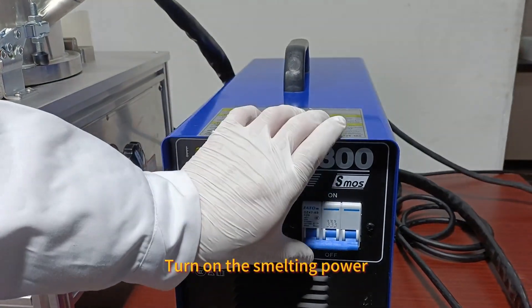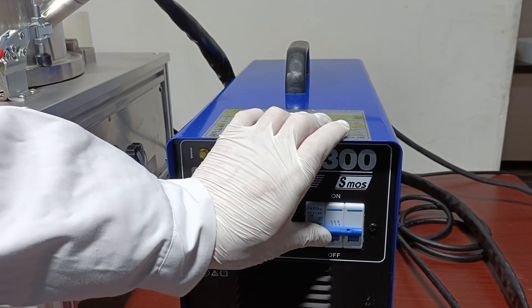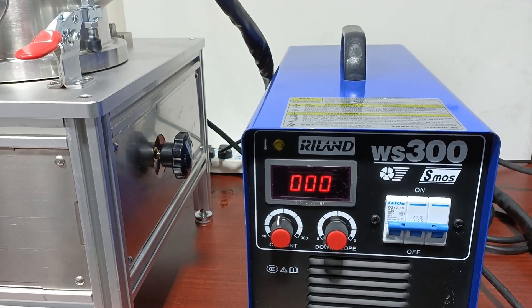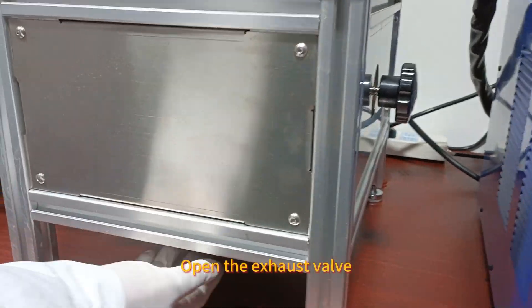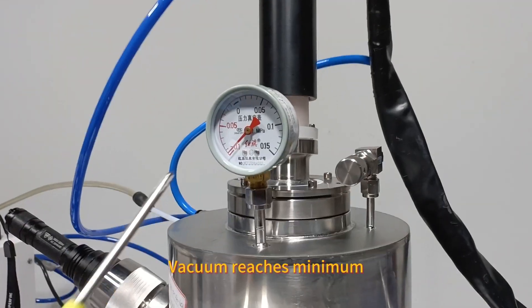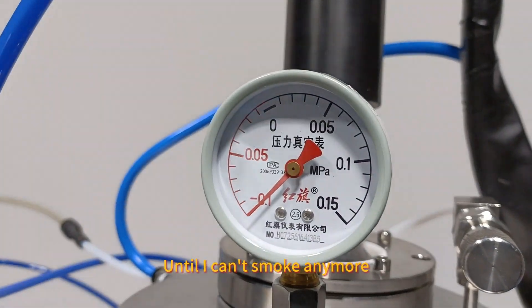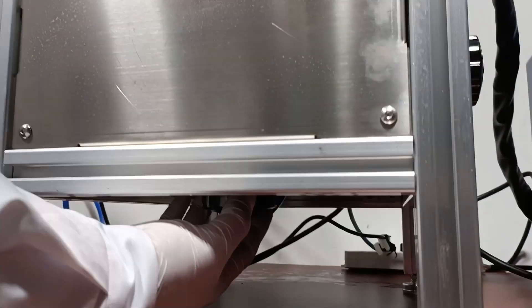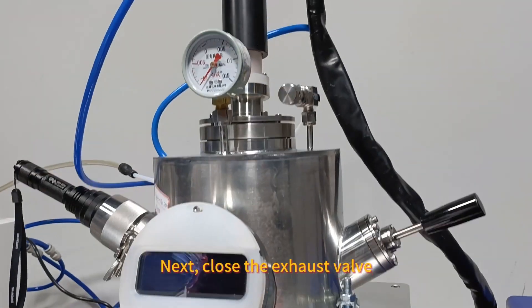Turn on the smelting power. Open the exhaust valve. Vacuum reaches minimum until it can't pump anymore. Next, close the exhaust valve.